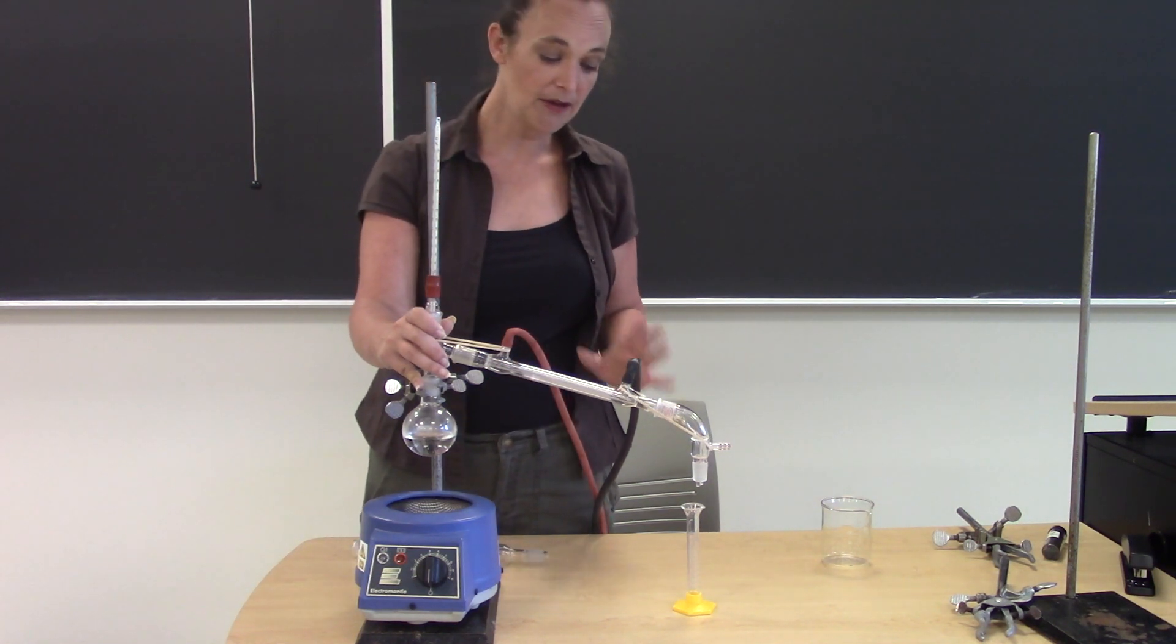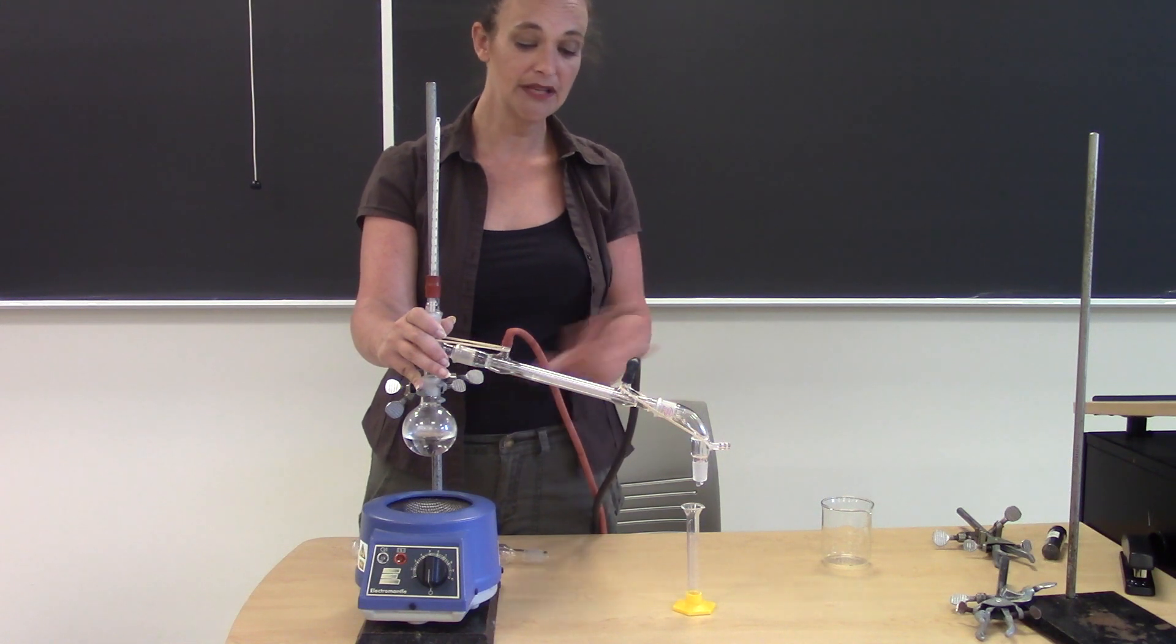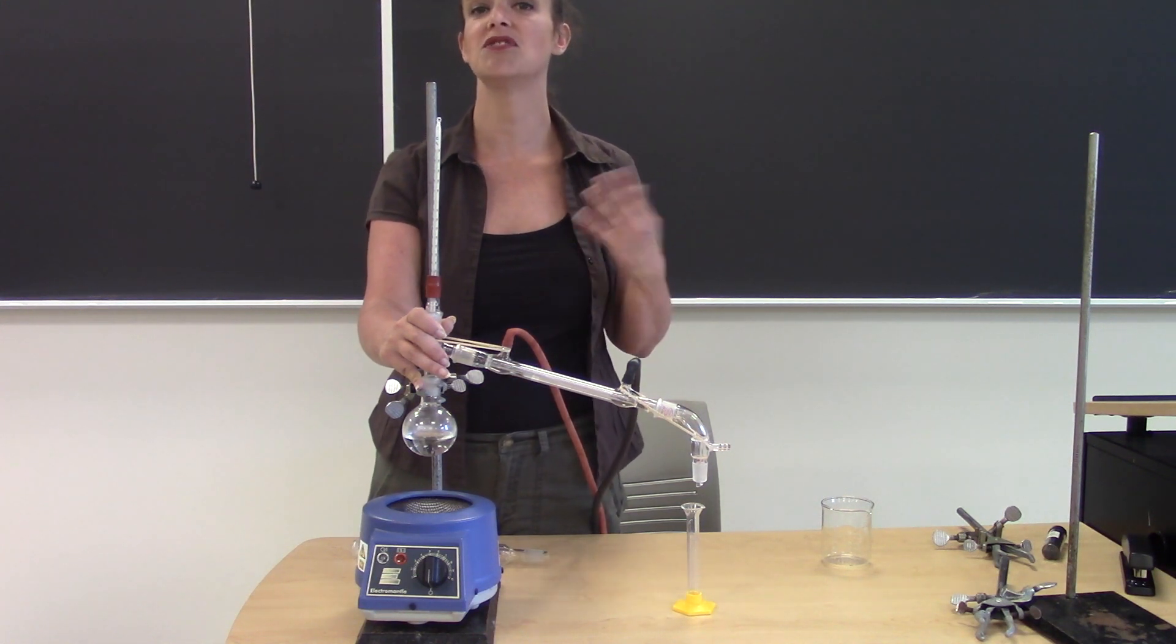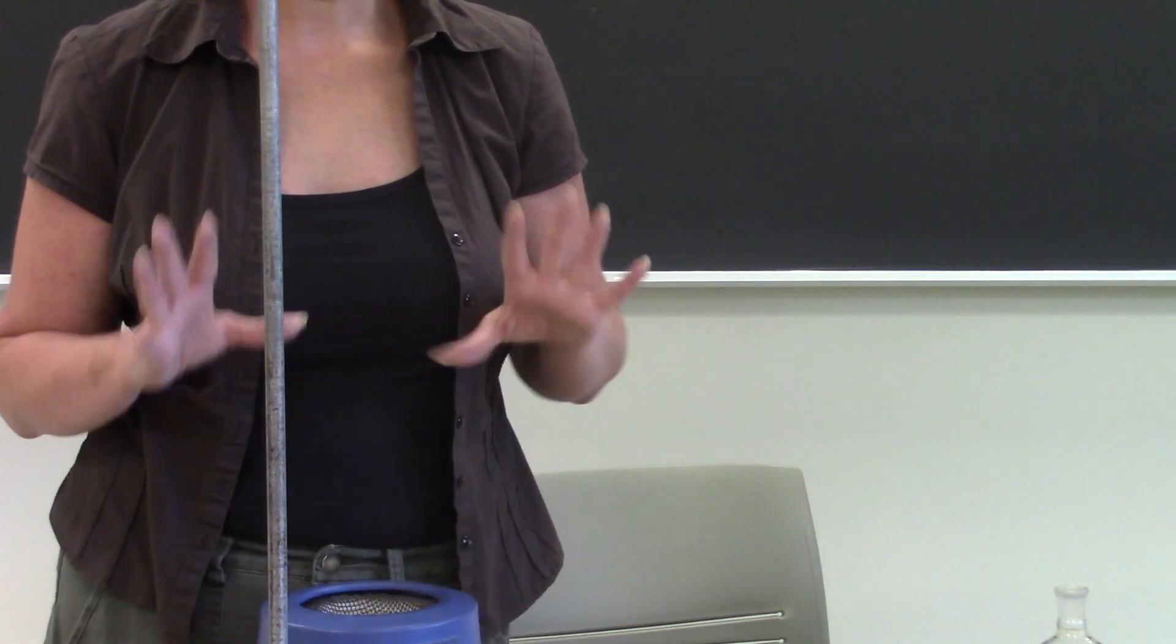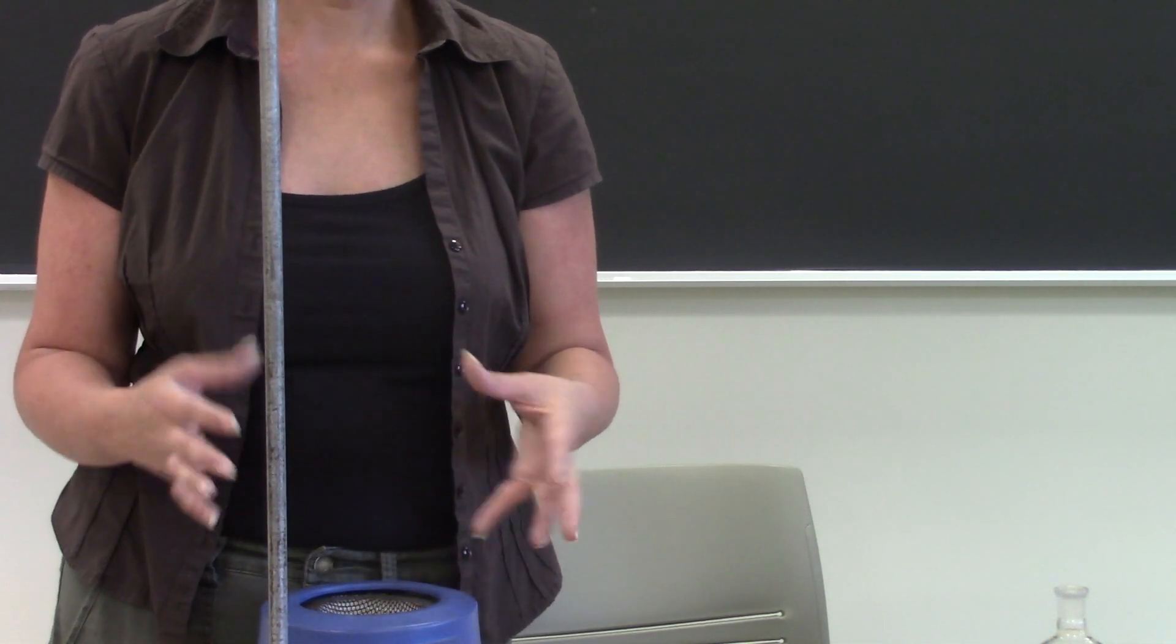So now I'm going to pause for a minute. I'm going to take this completely apart and I will put it together step by step for you. Okay now that we're zoomed in a little bit, I'm going to take you piece by piece in assembling your distillation setup.